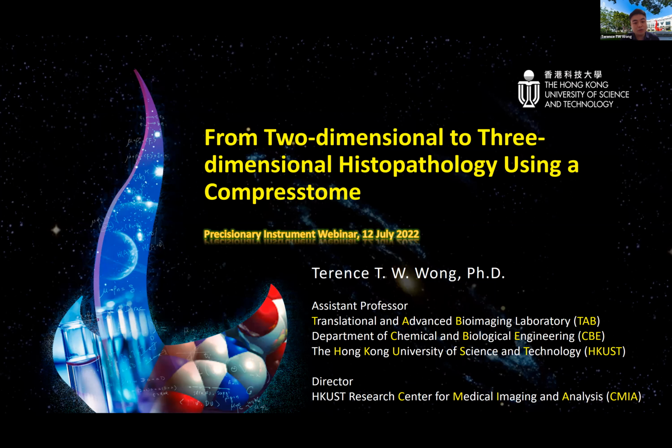And today we will go through the journey about histopathology. For sure, we will have some part of it, the usage of the Compresstome, help us to bring the histopathology from 2-dimensional to the 3-dimensional part.